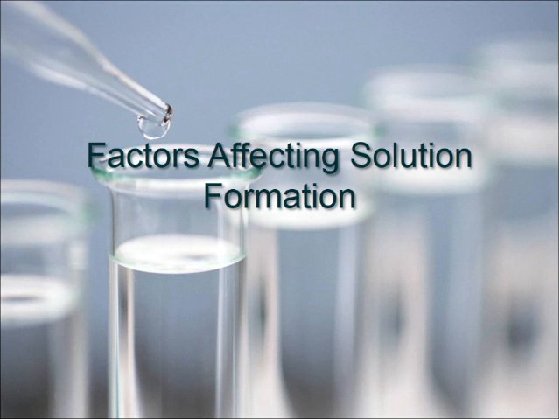You'll still see that nasty stuff at the top, but it's not part of it. It's just floating in there. It's based on density. It has nothing to do with being chemically the exact same.